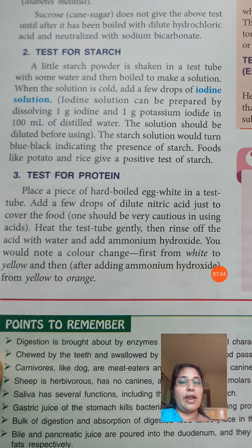Then after adding ammonium hydroxide, that yellow piece of egg changes into a bright orange color. That is the presence of protein. If you suspect any food content and want to know whether that food particle contains protein, we can do the same test.